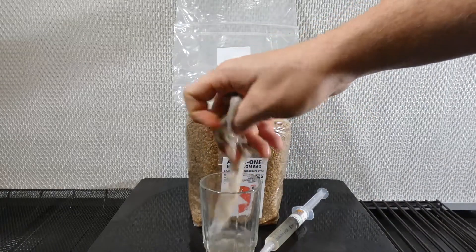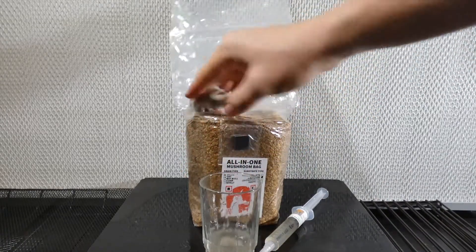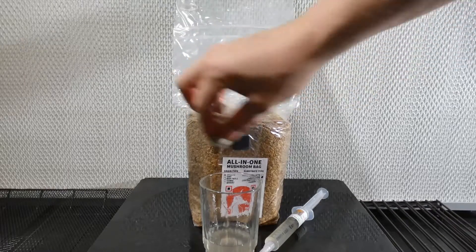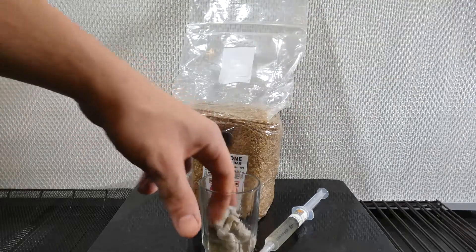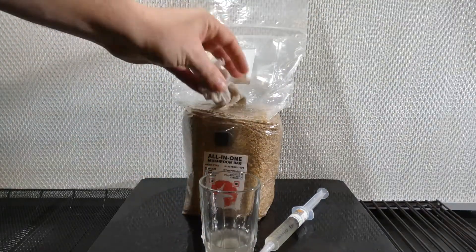Next, wipe down the area of the bag you'll be injecting. For this video, I'm working on it backwards to make it easier to see. Normally, your work area should be facing the direction of clean air. Remember that it's always better to be too wet than too dry.